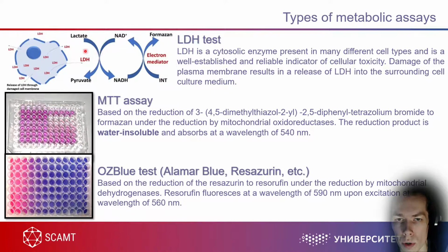Lactate. So how is this LDH produced? It's produced during the course of the lactate to pyruvate cycle, and upon interaction, so this LDH can further, well, not LDH, but this kit just measures LDH released in the culture media, so you don't need cells for this kit to work. And there are also some formazan compounds like in the MTT, because formazan is very well studied and so on.